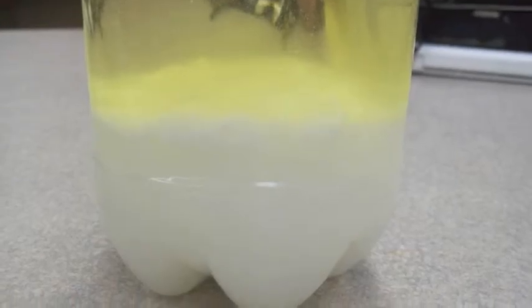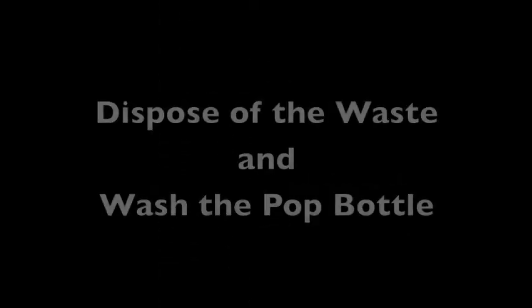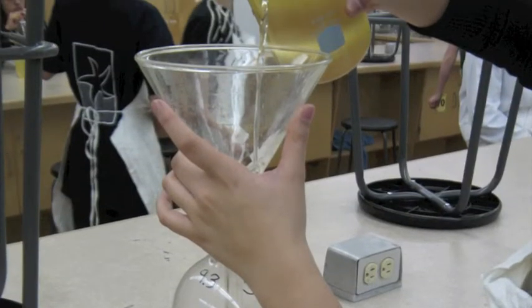Step 5: Let the biofuel settle for a couple of hours. Step 6: Slowly and carefully pour out the top layer of oil into a beaker, making sure not to get any of the soapy waste at the bottom. Step 7: Dispose of the waste and wash the 2L pop bottle. Step 8: Pour the oil back into the 2L pop bottle using the funnel.